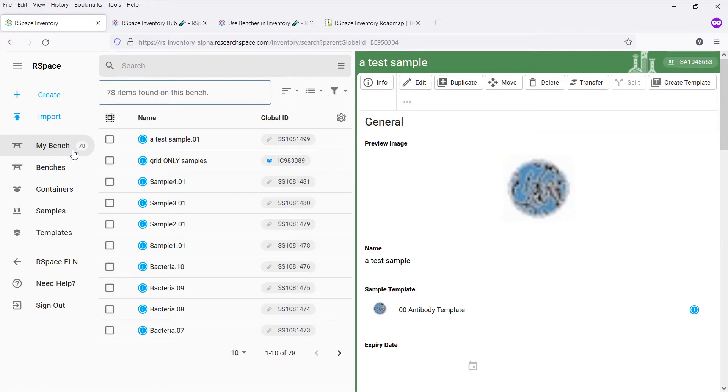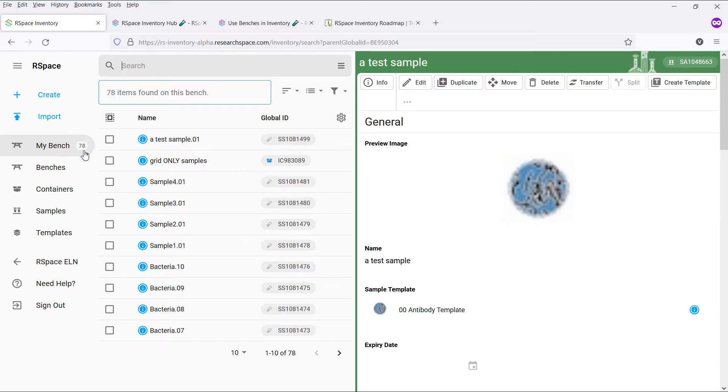Your personal bench can be accessed through the sidebar link, which also includes a counter of how many items you currently have on your bench. You might want to move an item to your bench if you have checked it out from a freezer and are currently working with it, so your colleagues know that this item can be found with you.